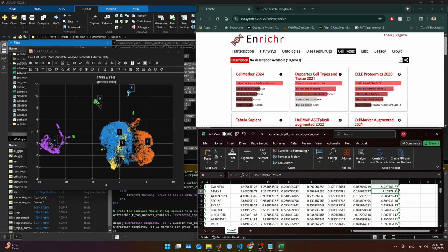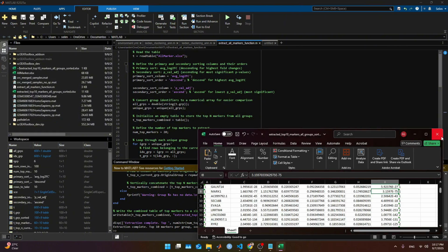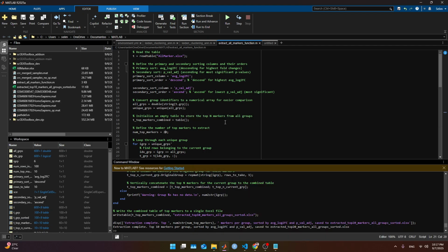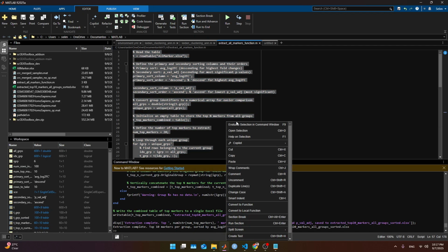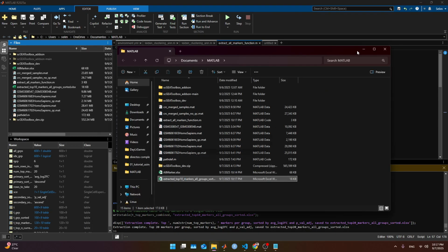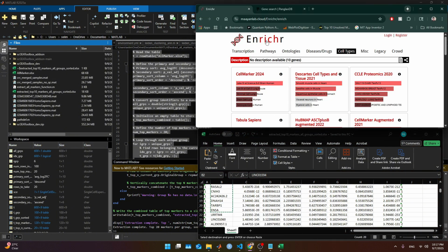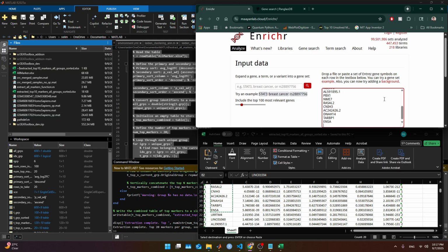What this means is that we have to increase the search to 20 markers. So I'm gonna run the script again and do it for 20 markers now. Run it again, and then open that Excel. And now copy the top 20. Those are gonna be top 20 for that cluster. And let's hope now it got cleaner.